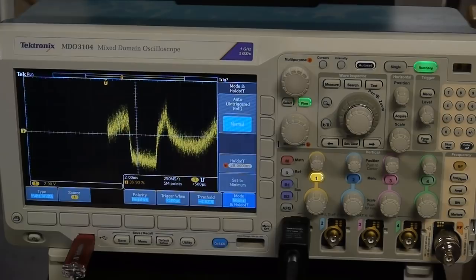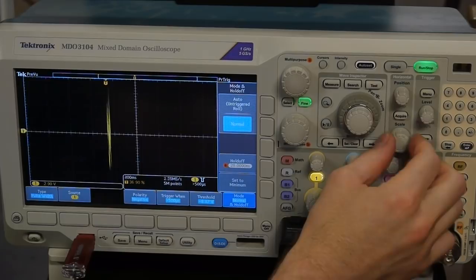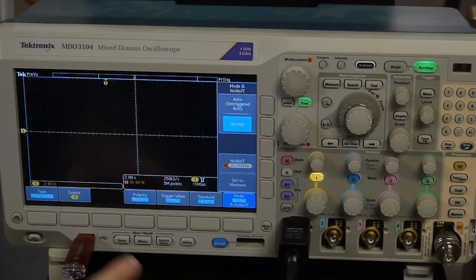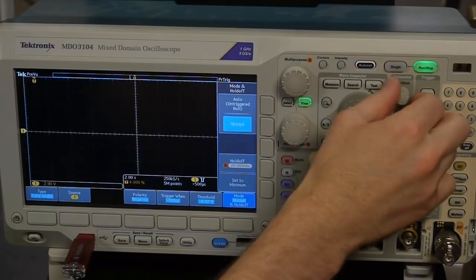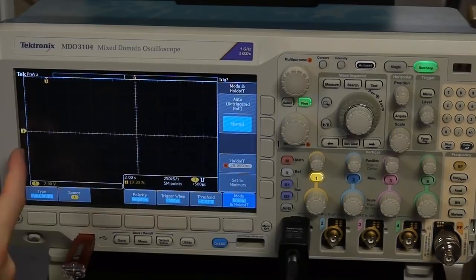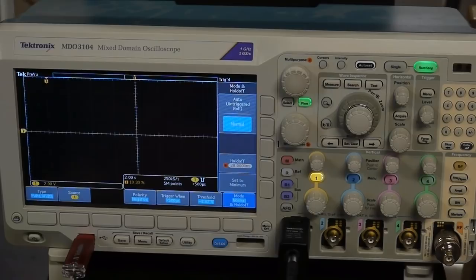So now all we have to do is set the horizontal scale so that we get this whole 10 second capture in one block. We'll change the horizontal scale to two seconds per division. And then we'll also change the trigger point to be right about there. So at this trigger point, this is going to indicate the start of a frame. So the scope just triggered, and unfortunately, in the normal trigger mode with these very slow capture rates, 250,000 samples per second, it doesn't actually show you the buffer filling as it's acquiring data.